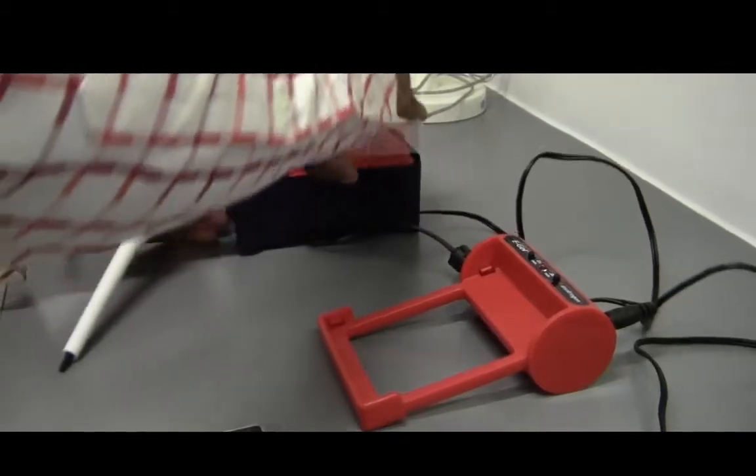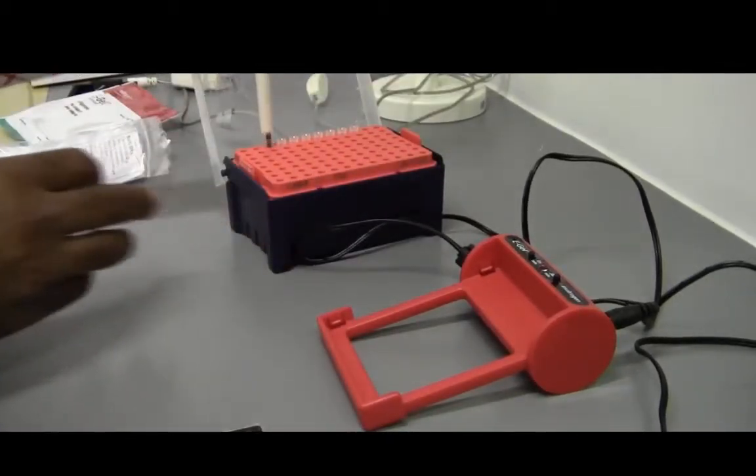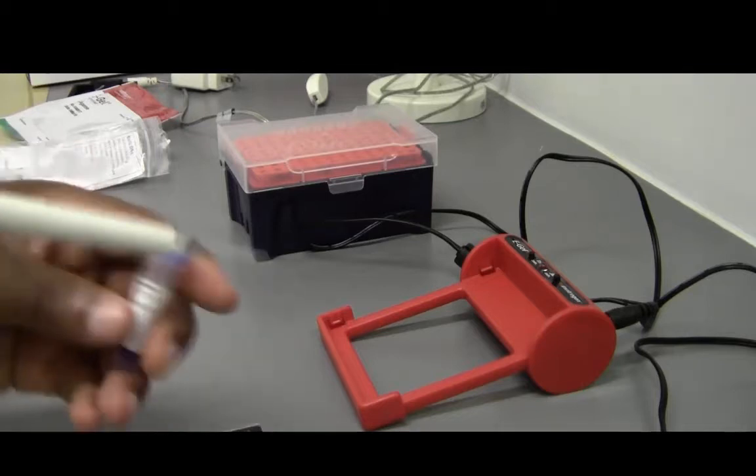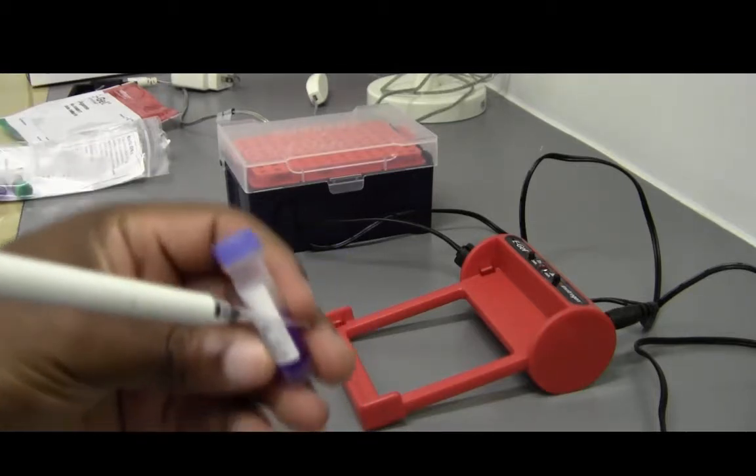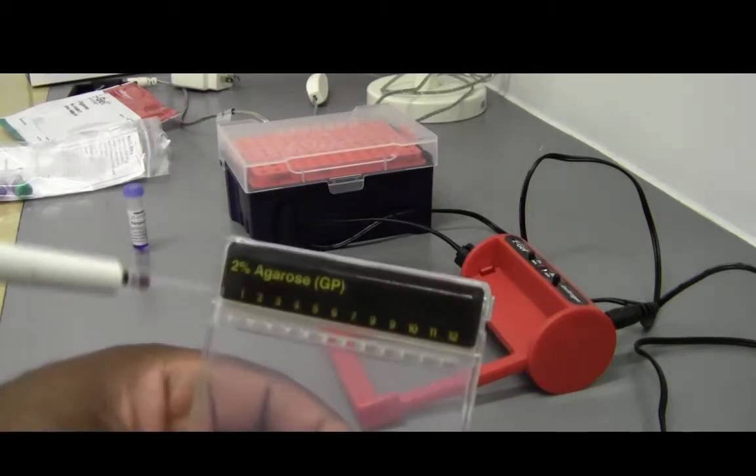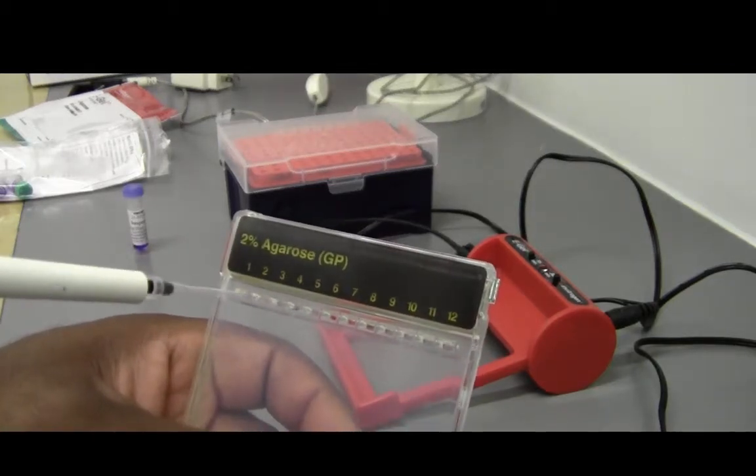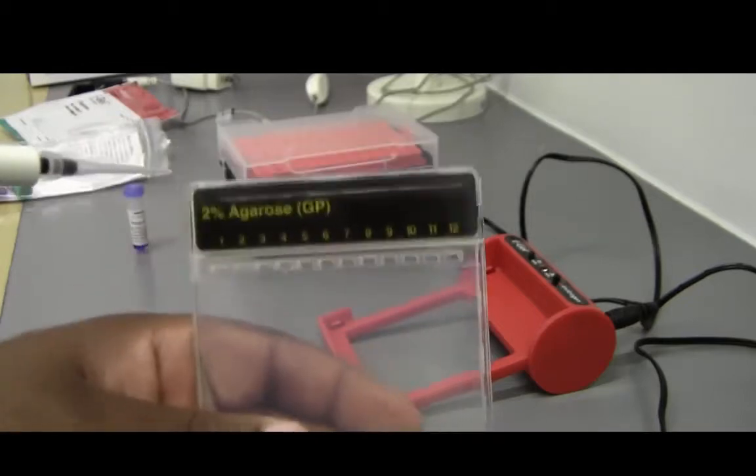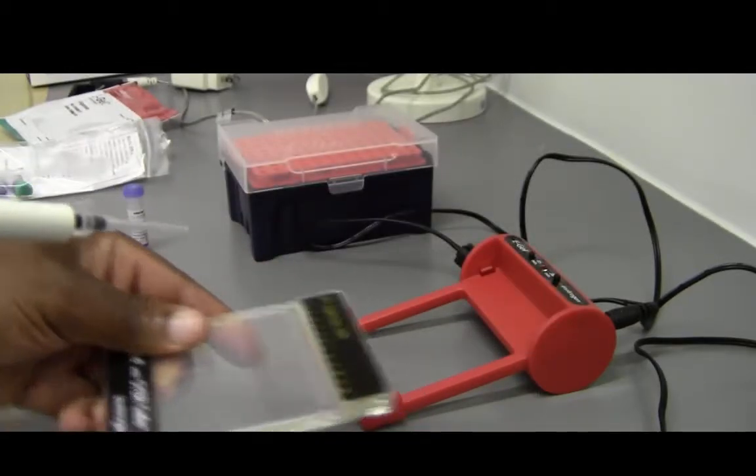So I'll get my pipette, my tip. Now I'll pipette my DNA sample and then I'll pipette into the wells. Of course I'm showing it face up this way but it should be flat on the surface.